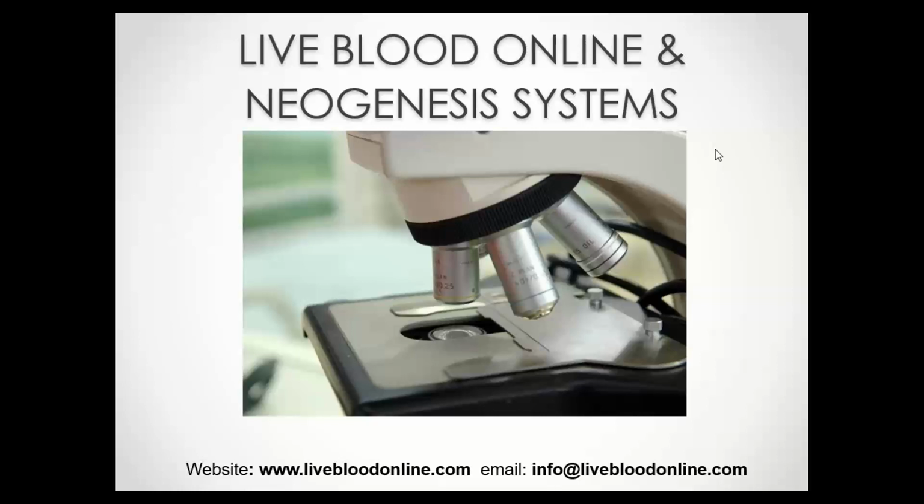Now, in practice, however, we simply don't see this type of variation. Now, of course, if a vegan decided to have a large steak a few hours before a live blood test, then we can expect to see the impact of this in the blood, definitely. But for patients following their normal daily routines, the results are always accurate and reliable.